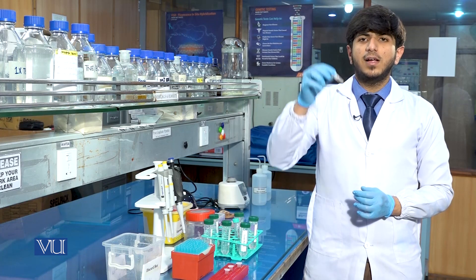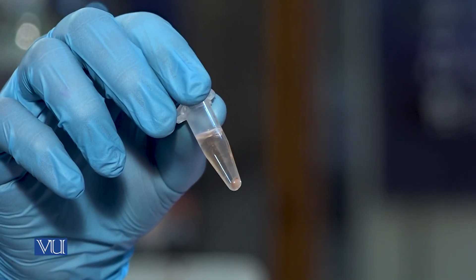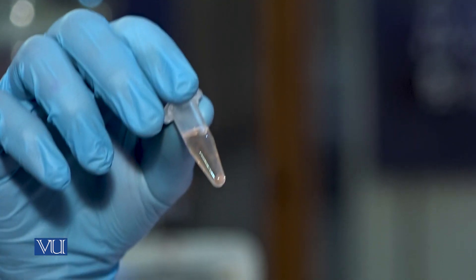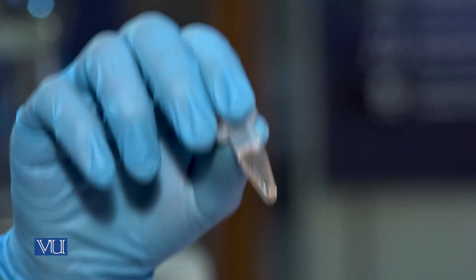After the second washing, the results will be like this. You can see the pellet has become somewhat colorless, but we will again do a third washing until the pellet becomes totally colorless.